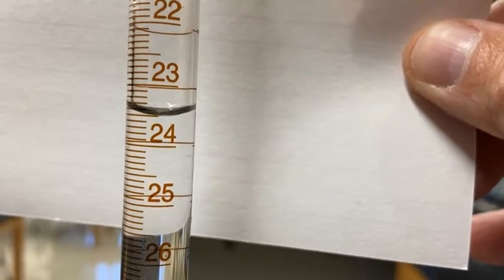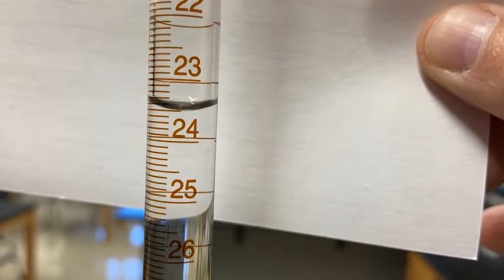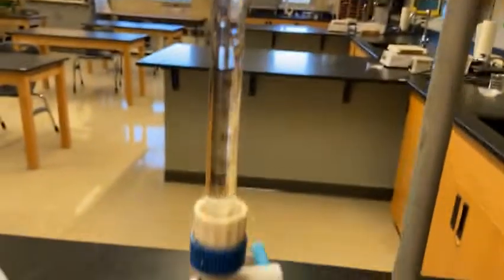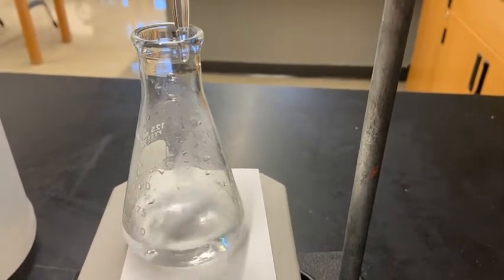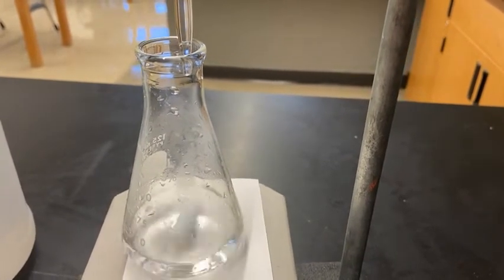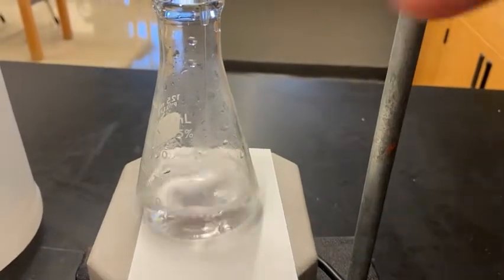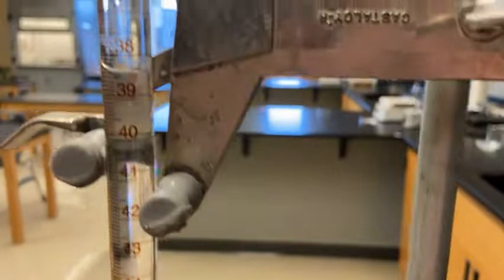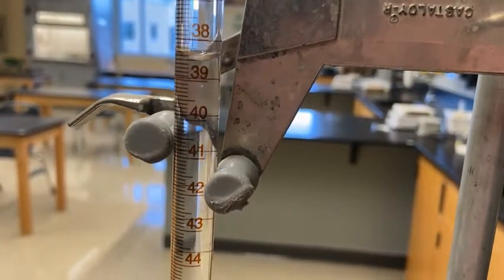We've set up Trial 3. Go ahead and read the initial burette reading to two decimal places — remember, if the first or second decimal place is zero, don't forget to write those zeros. Now I'm going to run the stopcock pretty fast. We're roughly at 24 on the burette, and 24 plus 18 is 42, so I'll run it fast until I get to about 41 milliliters. You can see the volume going down — I'll stop when I get to about 40 and a half.